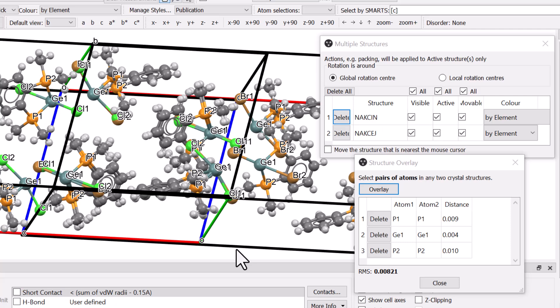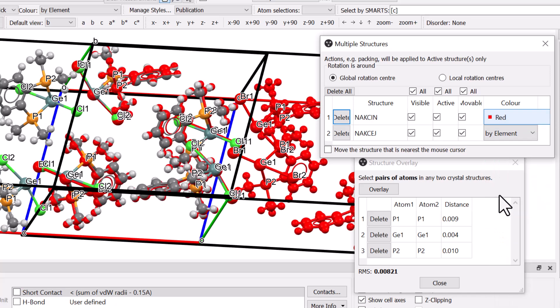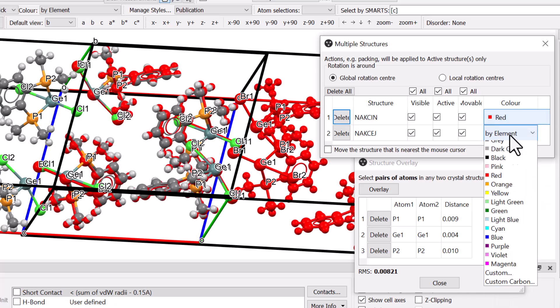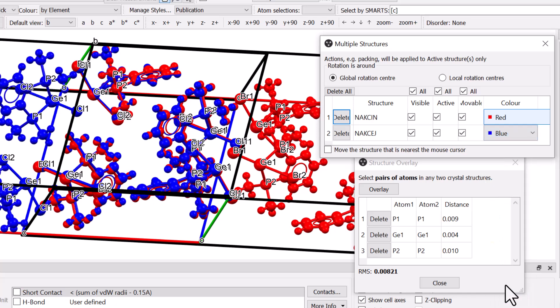You can change the colour of the structures from the Multiple Structures window using the drop-down menu in the Colour column to highlight the differences. Here we choose Red and Blue.